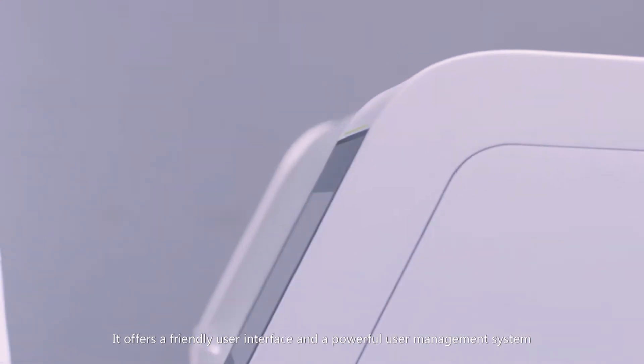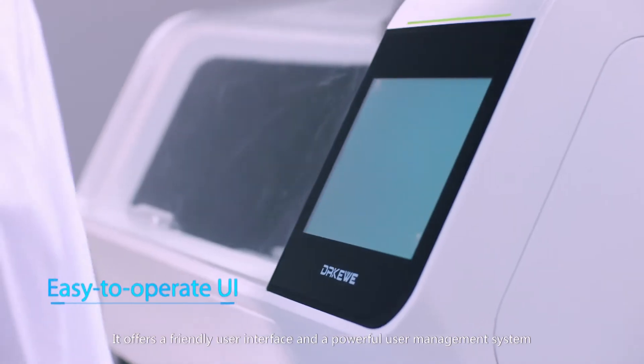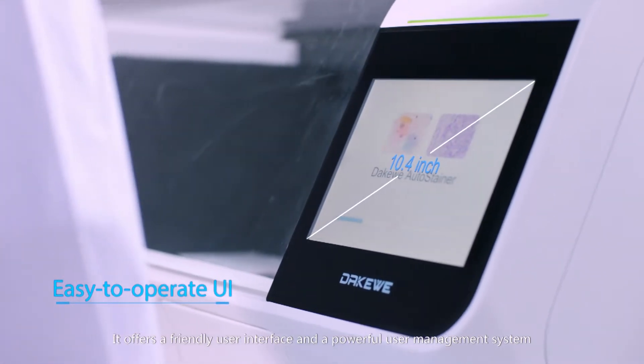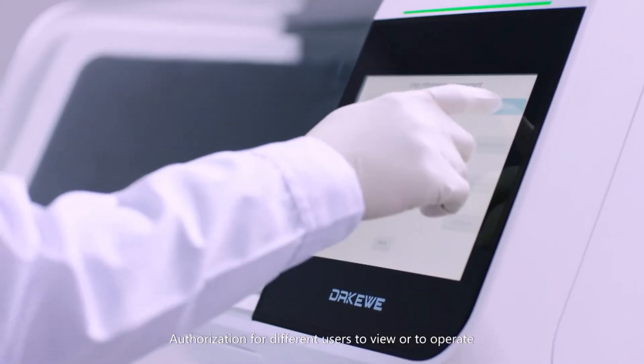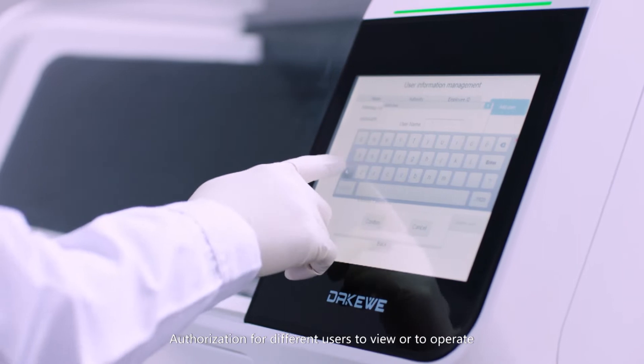It offers a friendly user interface and a powerful user management system with authorization for different users to view or to operate.